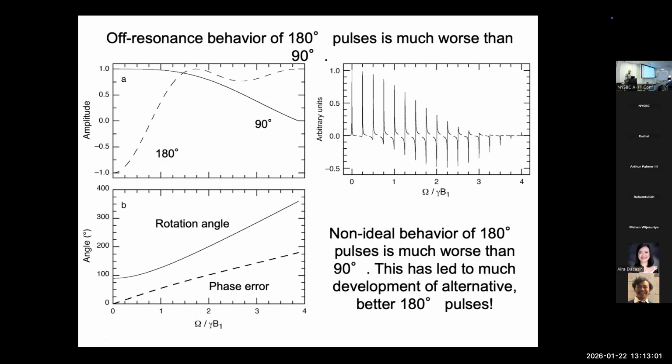So that's also a terrific thing about a 90-degree pulse: the most important part of its off resonance effect is a linear phase error. And that's either correctable with a first order phase or by adjusting some times somewhere in the sequence. And again, you'll work that out some in the problems.